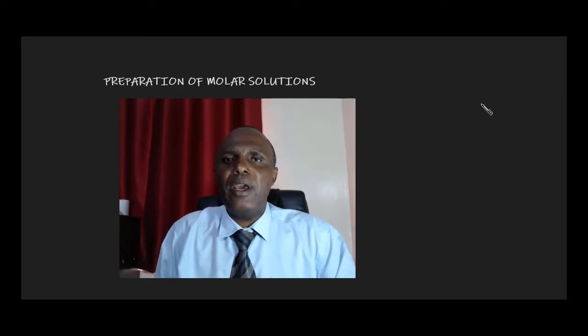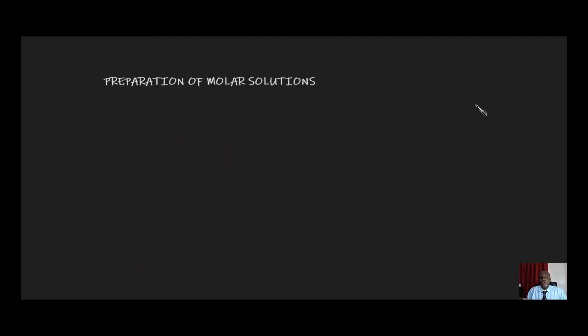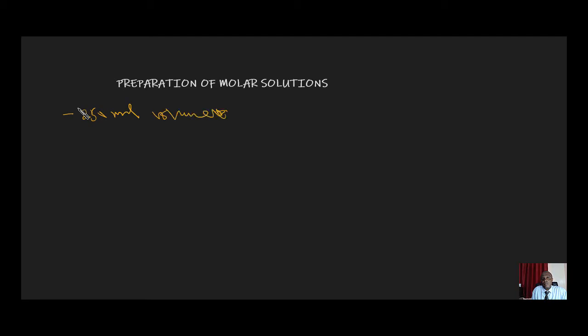So today I want us to learn how to prepare molar solutions, and I would like us to prepare a solution of oxalic acid. These are the things we need. One, we want a 250 ml volumetric flask. We would like to have water. We'll also need a weighing balance. And that is all that we need.